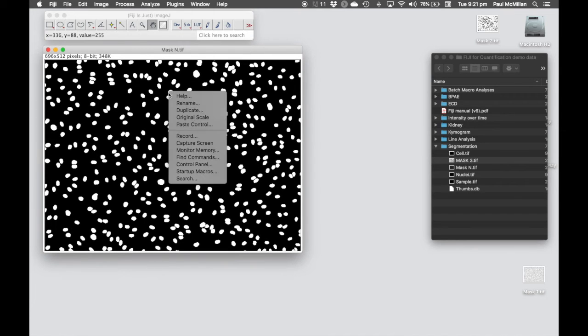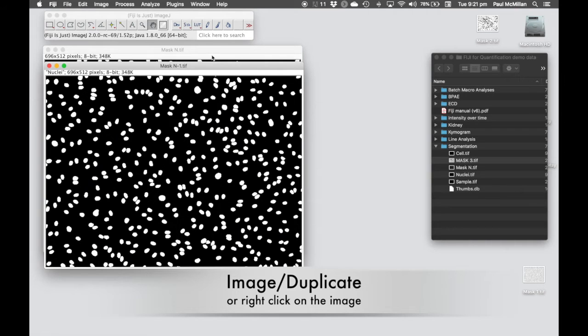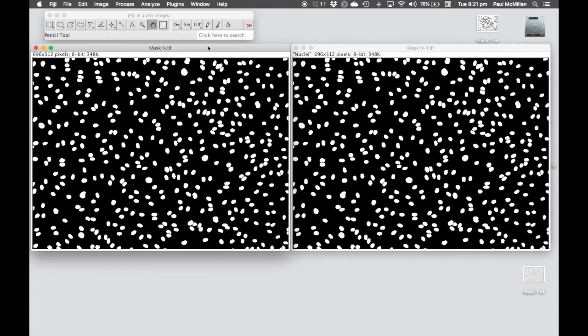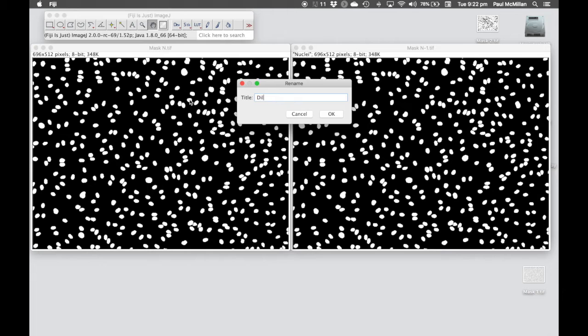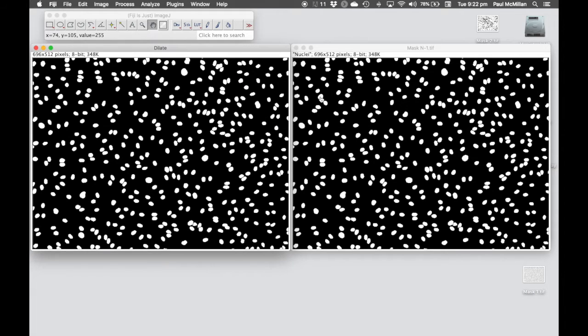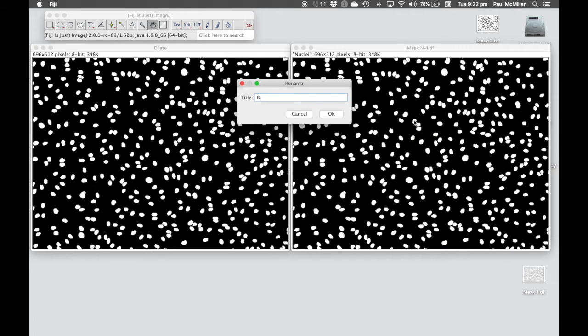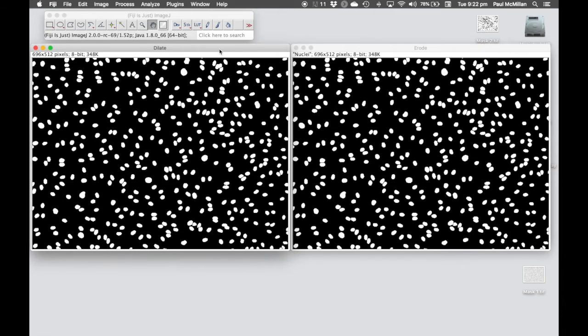So in this case, I'm going to duplicate these images again, and we're going to rename them. So let's rename one dilate, and we're going to rename the other one erode. And you'll never guess what we're going to do with these.